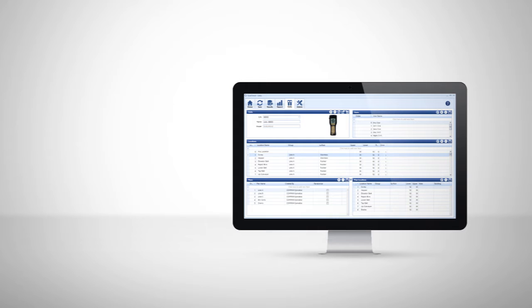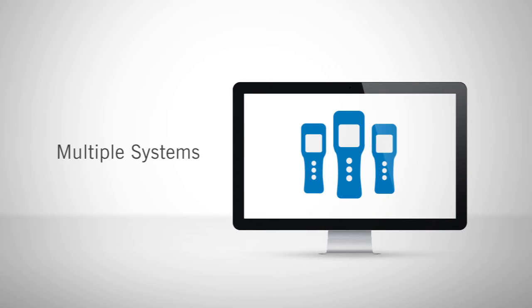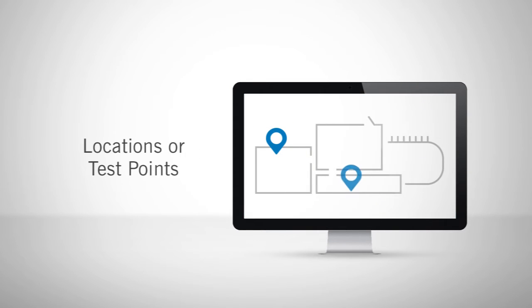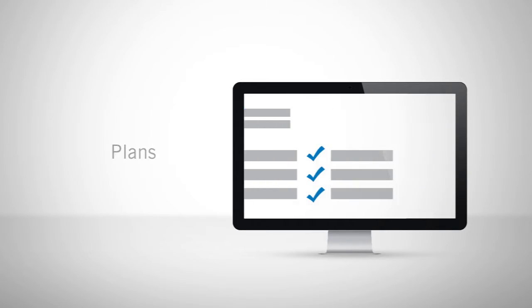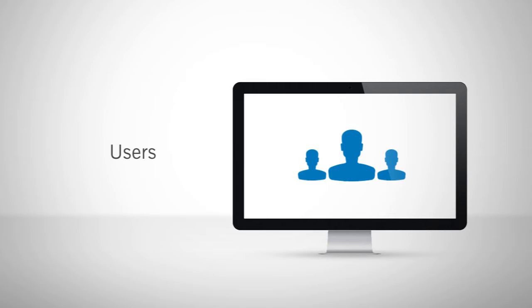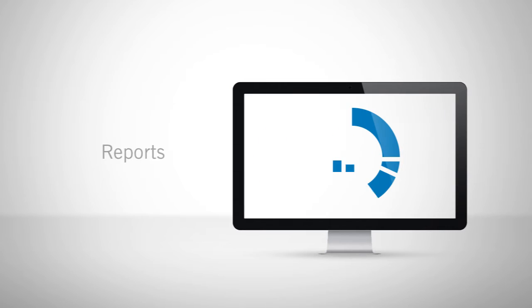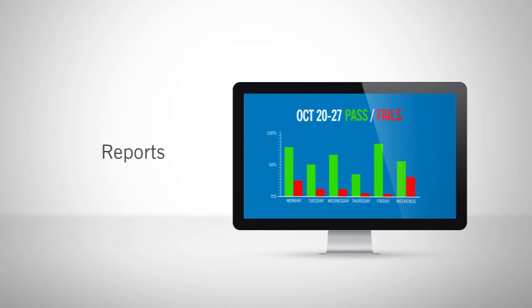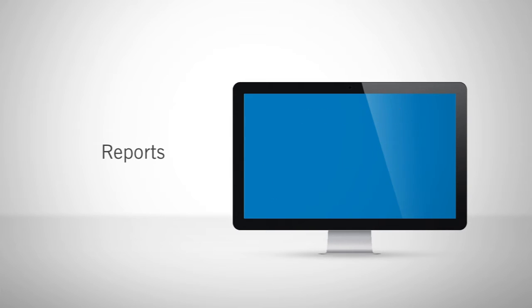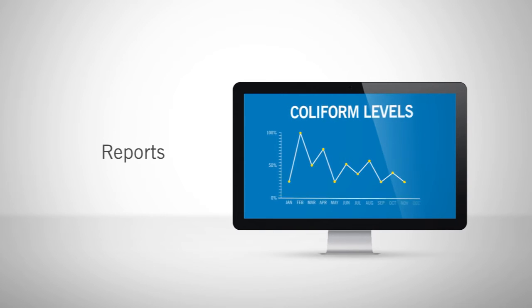The easy-to-use interface allows users to program and manage multiple systems, designate thousands of locations or test points, customize test plans to organize a testing schedule, and specify users to track personnel performance. With over 30 pre-programmed reports, SureTrend effortlessly generates charts and graphs to track and trend your test results.